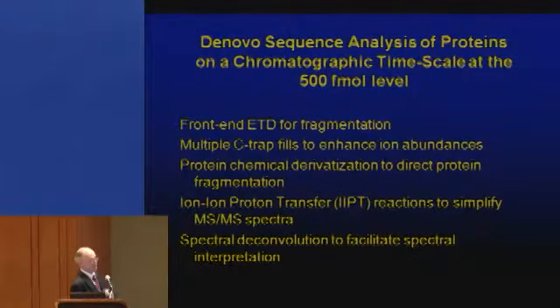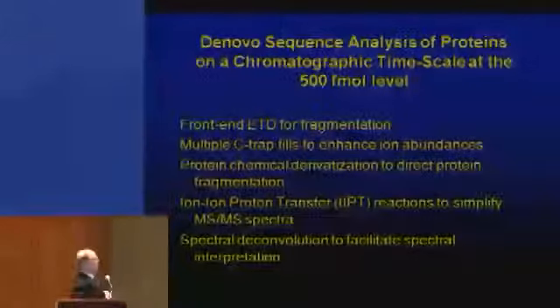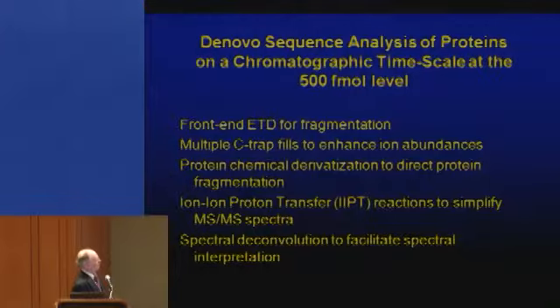And if I have my way, I want to read the sequence from the N-terminus all the way to the end, and I want to read the sequence from the C-terminus all the way to the end. And in fact, do it so you can look at it on a piece of paper and do it yourself if you want to. That's what I'm spending hours doing at the moment. Okay, so it's going to have front-end electron transfer dissociation.